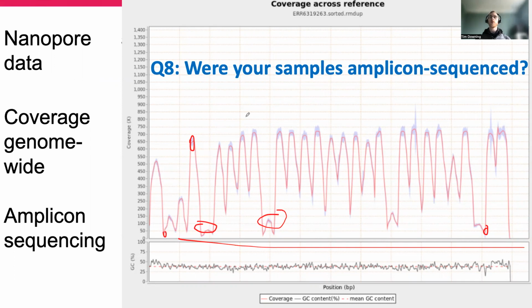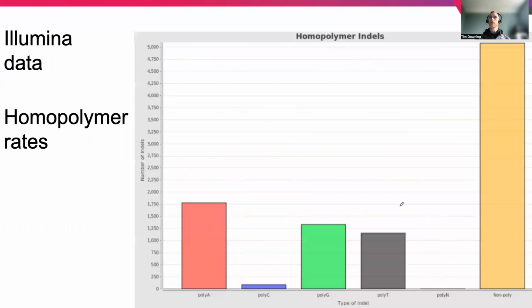We also know that if we try to de novo assemble this alone and there are insufficient reads at each of these boundaries, like here and here, it may not assemble altogether as a single contig. We can also look at things like the homopolymer rates and other error rates and explore if there are artifacts that might affect, say, our capacity to identify indels.